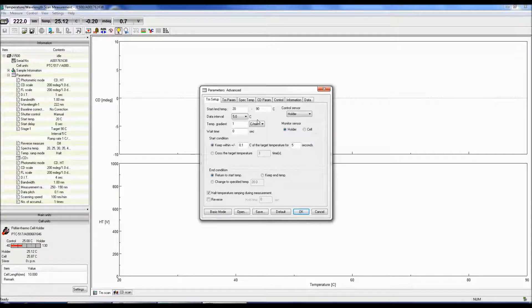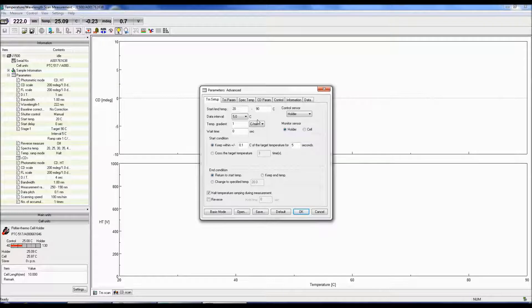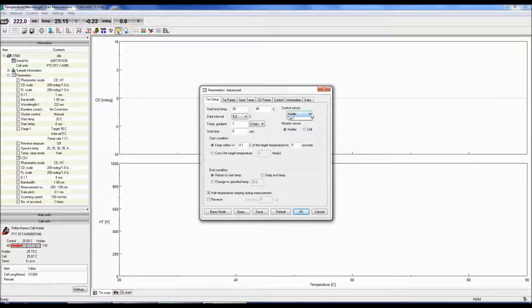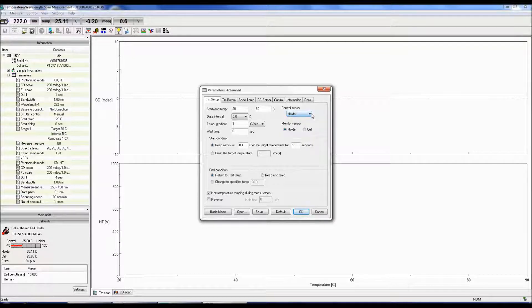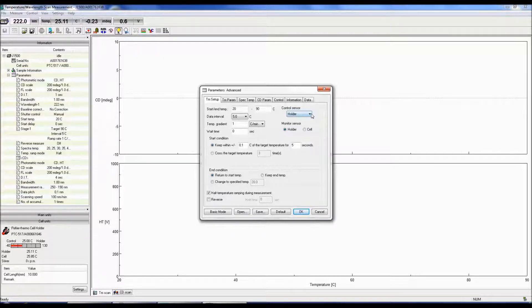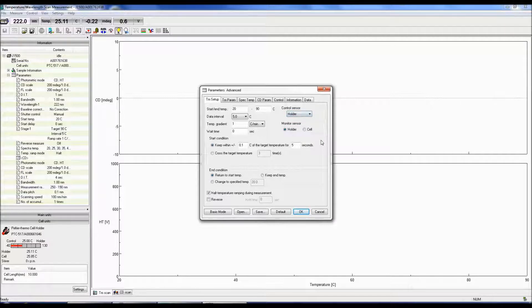The wait time is the period before the next measurement begins after hitting the target temperature. This time is dependent on how long it will take your sample to equilibrate. The control sensor selects the sensor for controlling the temperature, which can either be the cell holder or the temperature probe in the cell. The monitor sensor is the current temperature of either the cell holder or the temperature probe in the cell.